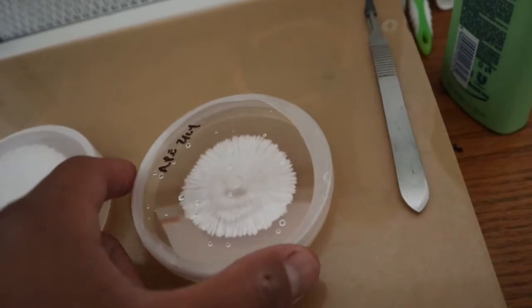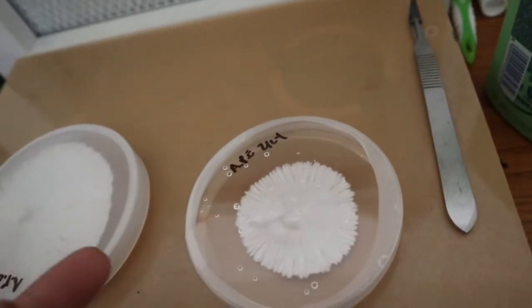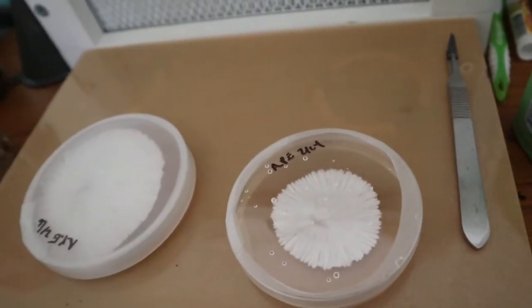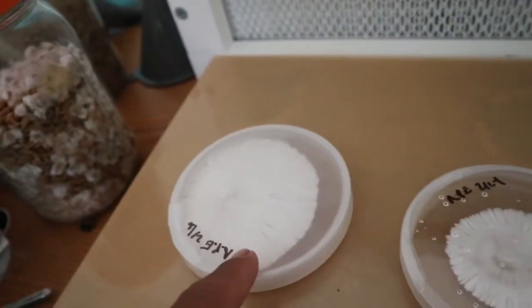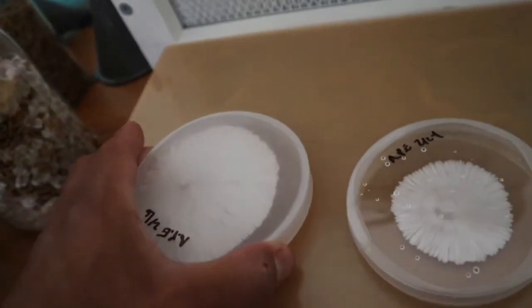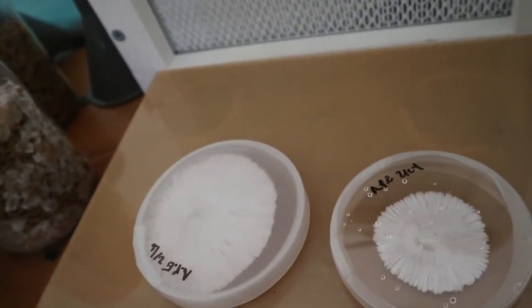The upside to using these is that they're cheaper and you get a lot of them online. I get about like a 500 box for a really cheap price as opposed to these. But the thing is you're gonna have these for life forever.